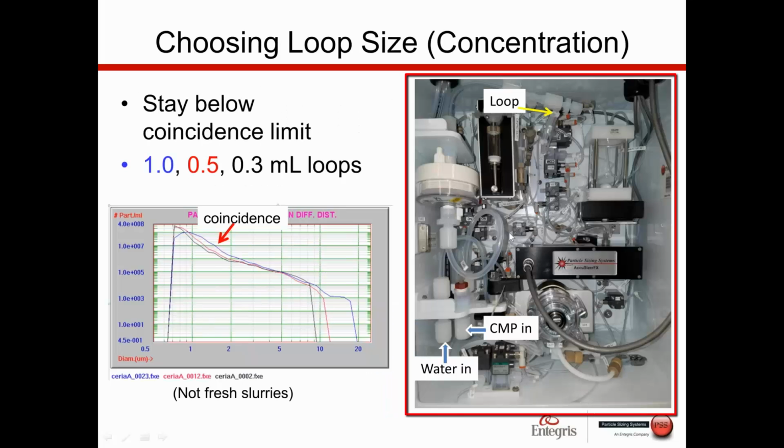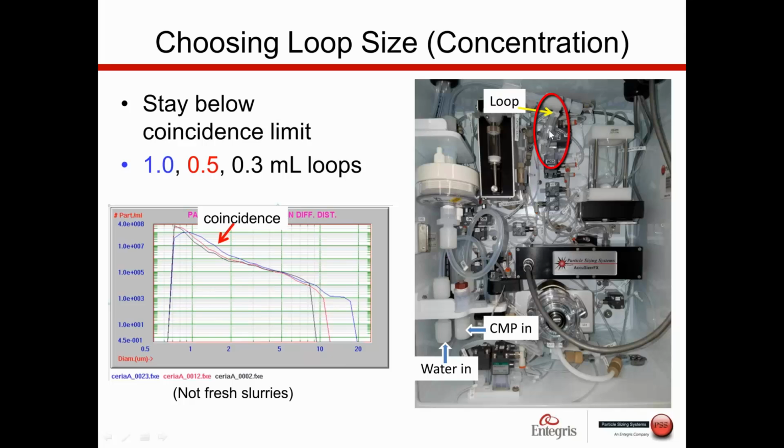To the right, we have the internal fluidics of the Mini system. And you might have trouble seeing it, but here's a sample loop. So I'd mentioned earlier we can inject the sample into a loop before it goes into the dilution chamber, which is shown over here. With the Mini, you could also bring a bottle of sample to the Mini, and a pump can bring it up through the system, and we can practice the best way to measure the system, even using the Mini.